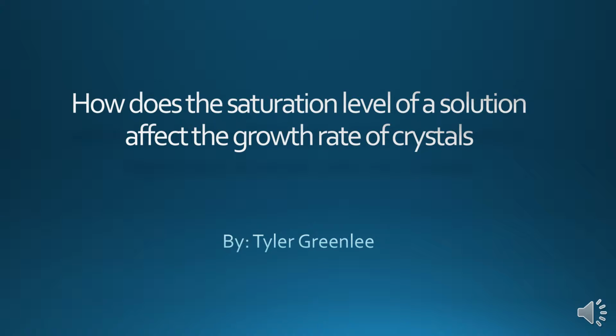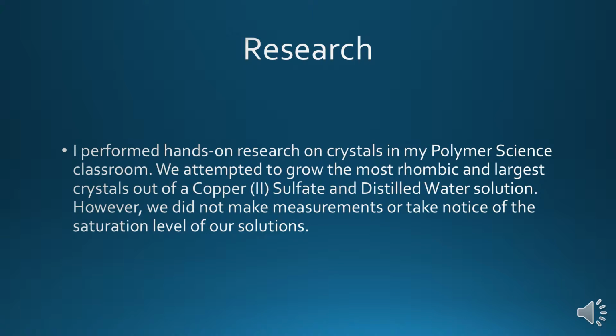How does the saturation level of a solution affect the growth rate of crystals? I performed hands-on research on crystals in my polymer science classroom. We attempted to grow the most rhombic and largest crystals out of a copper-2 sulfate in distilled water solution.